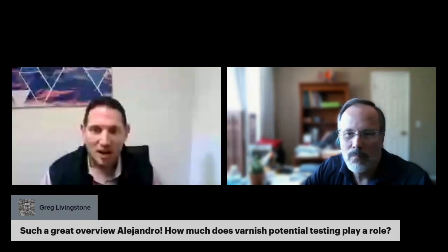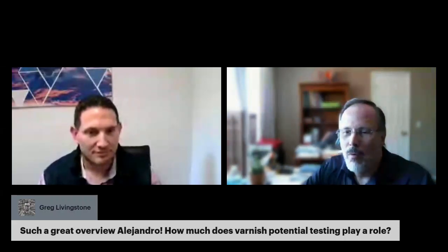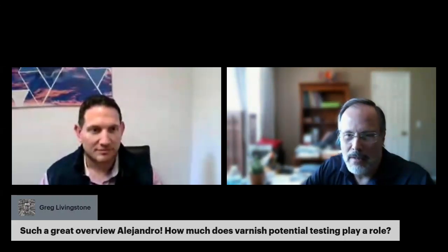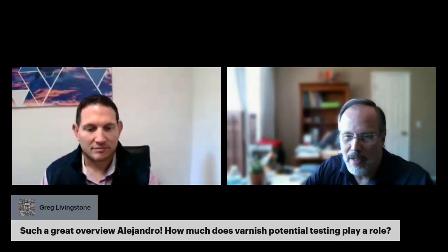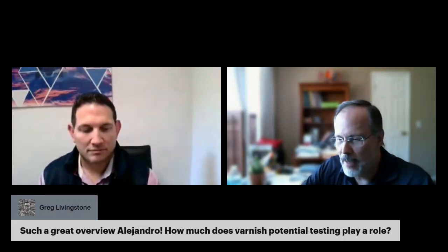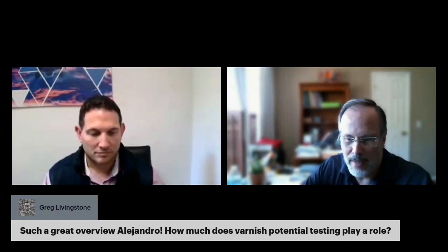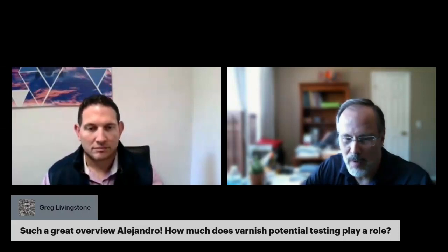How much does varnish potential testing play a role? Well, varnish potential is very important in certain applications like turbine oils, compressor oils. And varnish potential is part of our routine oil analysis. Varnish potential helps us to predict potential future failures in the lubricant and in the machine consequently.